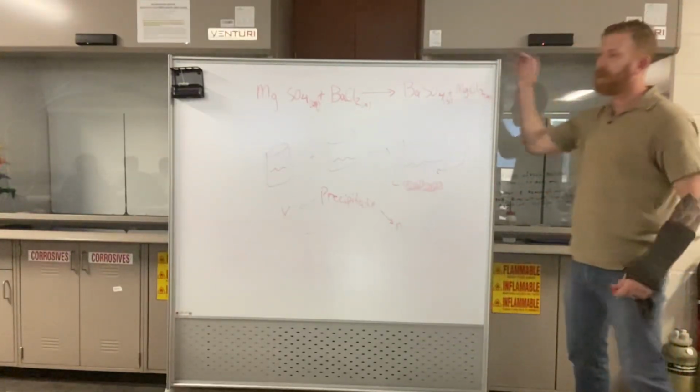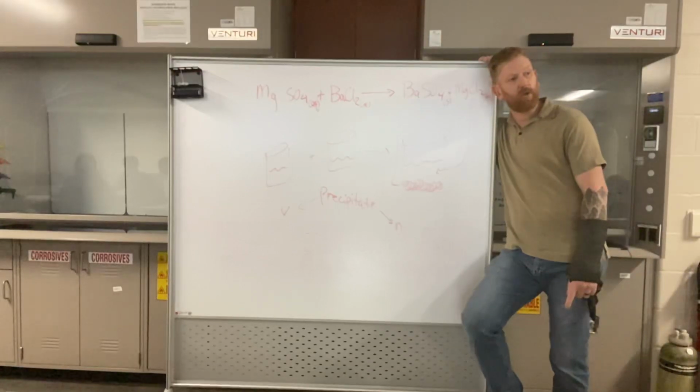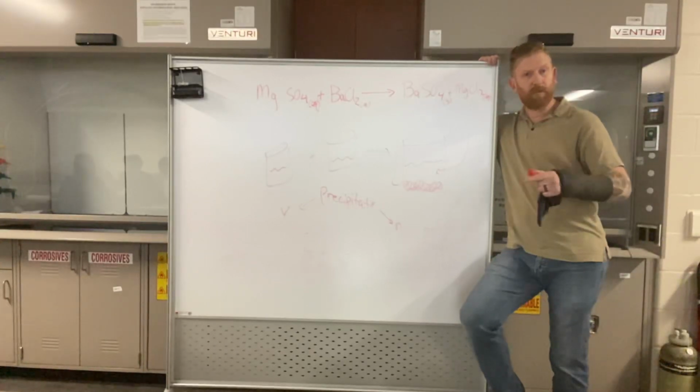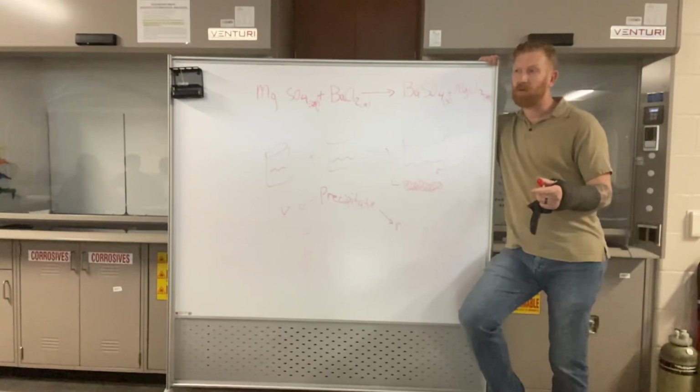This is basically all we're going to do today. We're going to do it 12 times. We're going to make some predictions based upon what's mixing together, whether we think there's going to be a precipitate come out.